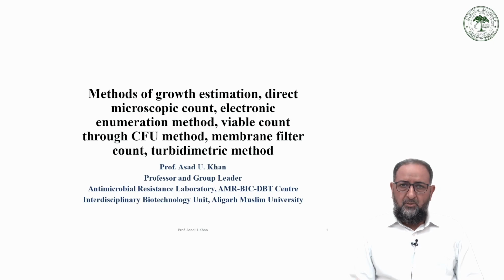Why growth estimation is important is a big question which we discussed in my last lectures. Now we will discuss some more detailed methods today, how this estimation can be precisely calculated and precisely implemented in microbiology to provide the best possible application in the environment, the food industry, and of course the medical industry, in clinical medicine.